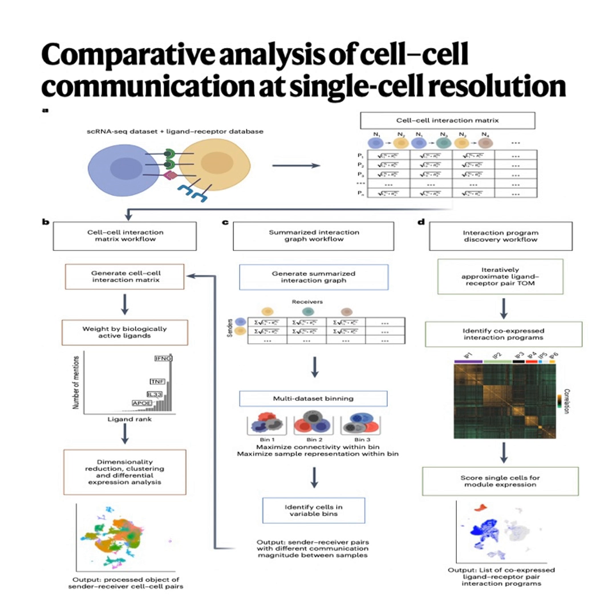When they reanalyzed using Scriabin's binning workflow, remember, the one that carefully aligns cells across samples? Yeah, the high-resolution registration. It showed that the apparent high IL-1B signal wasn't a general feature of RR granulomas. It was basically being driven by one single RR sample that just happened to have a lot of T cells expressing IL-1B. It was an outlier skewing the average. The classic outlier problem, masked by aggregation.